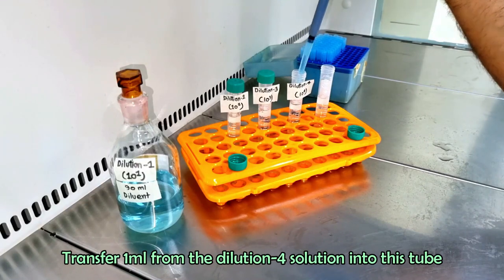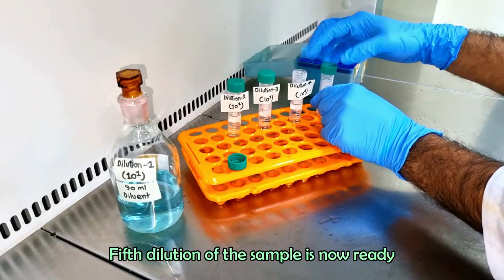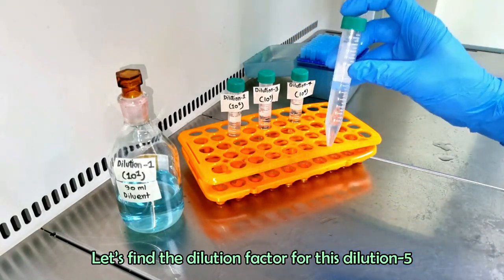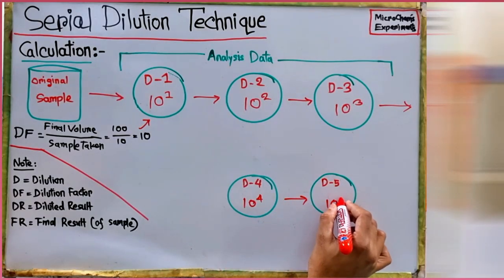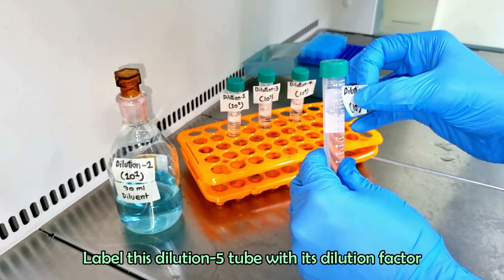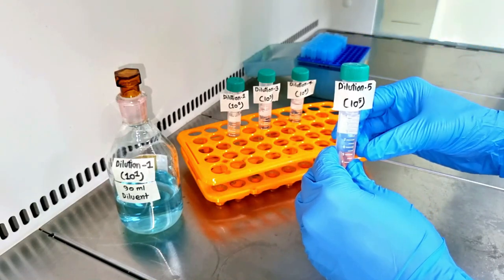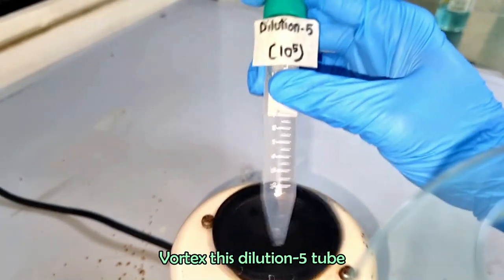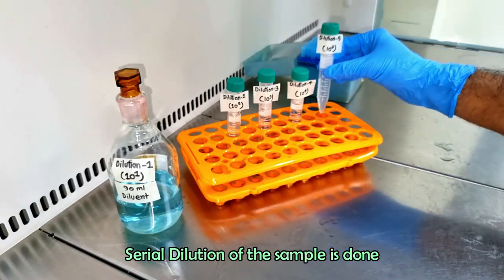Transfer 1 ml from dilution 4 solution into another 9 ml diluent tube to make the dilution 5. The dilution factor at this point is 1 lakh, so we can write 10^-5. Vortex this dilution 5 tube. Dilution of our sample is done by serial dilution technique.